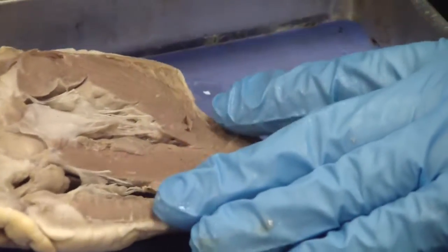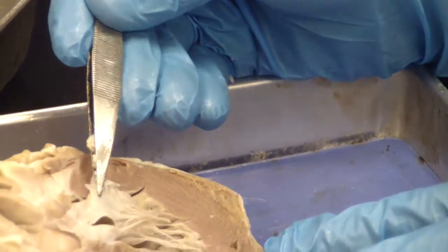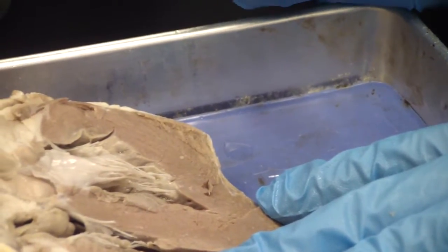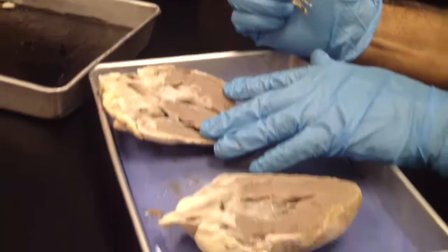Okay. Here's the left atrium, yes? With the left ventricle. And between left atrium and left ventricle we have the bicuspid valve or mitral valve. And then those are the chordae tendineae, and these are the papillary muscles. So this is the atrium? This right here, I guess part of it is right here. So that's the left auricle. So this would be the left atrium, and that's the left ventricle.